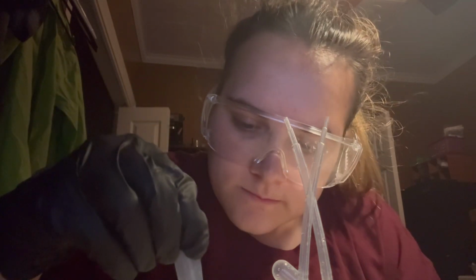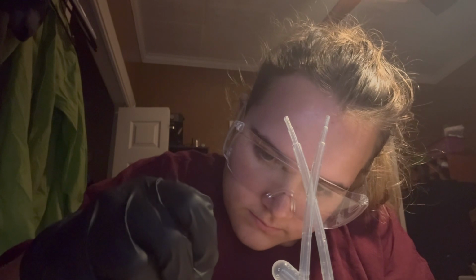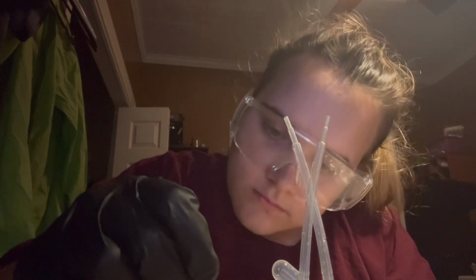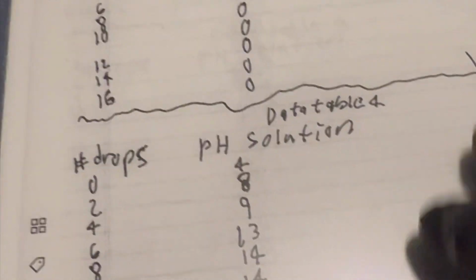Now we'll do 4 drops. Okay. So the pH is now around the 10. And I'll log the rest of the results to y'all. So here are my results for all the data tables.